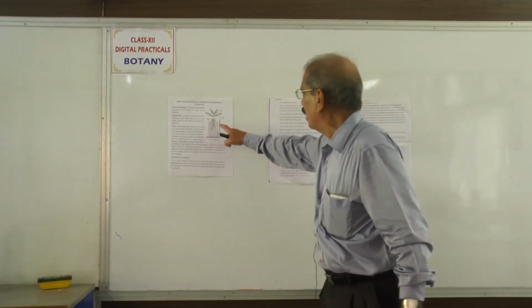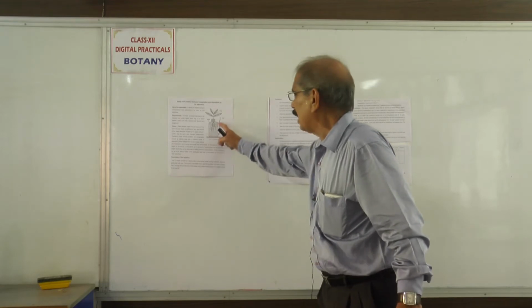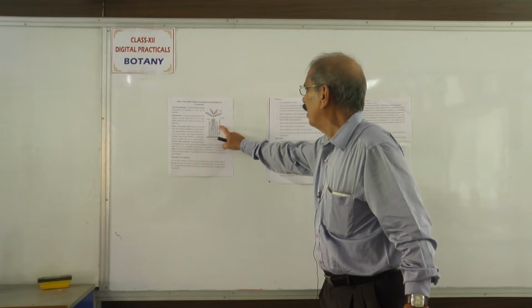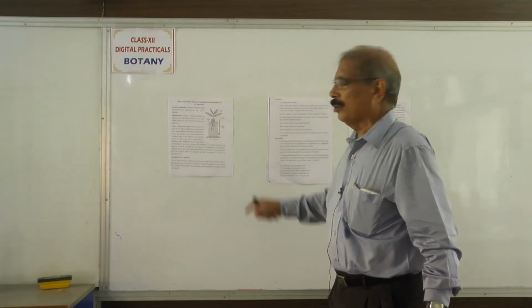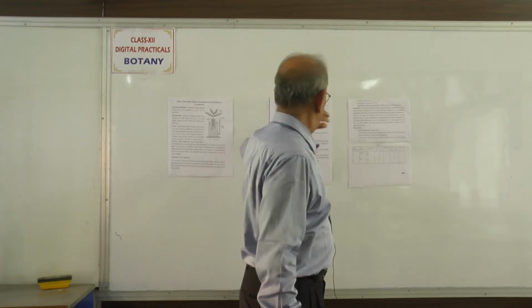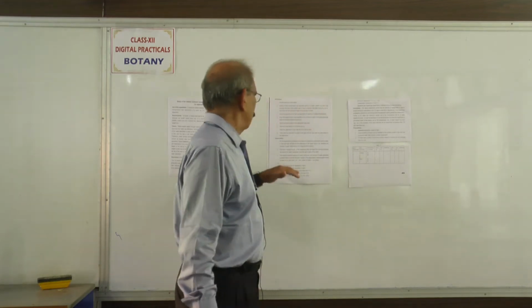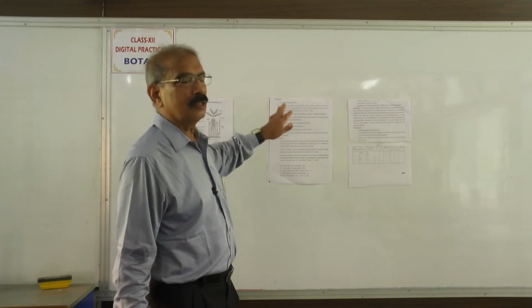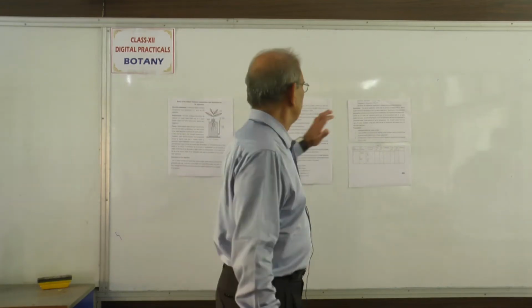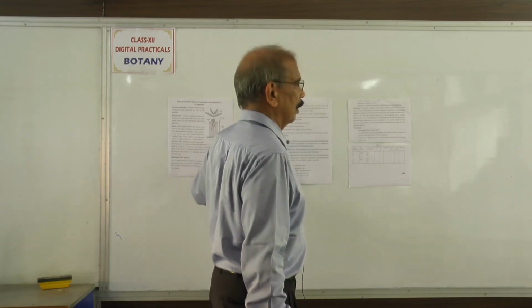This is the graduated side arm, the side tube. So supposing you start at 1, and it ends at 3, then you have to write that. In the observation you have to record: what is the initial weight? What is the final weight? What is the initial reading in the side arm? What is the final reading?